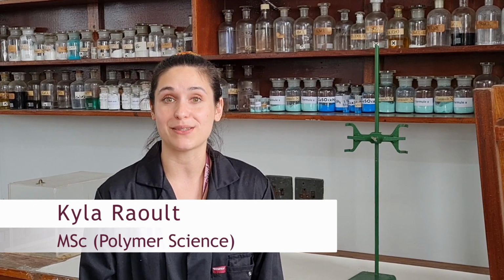Welcome to the Chemistry 124 demonstration videos. This video will be involving Practical 2, which is about limiting reactions. During this practical, you will react hydrated copper chloride with aluminium in two different reactions. In the first reaction, you will use the hydrated copper chloride in excess, and in the other reaction, you will use the aluminium in excess.